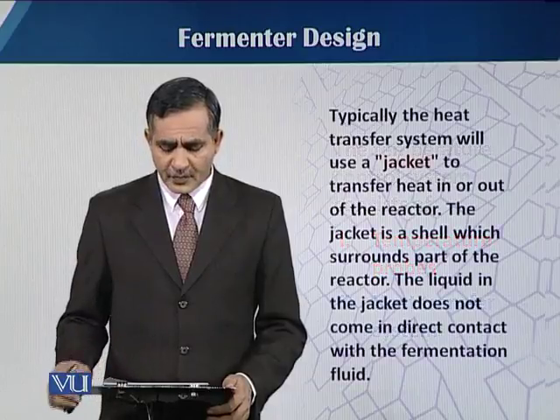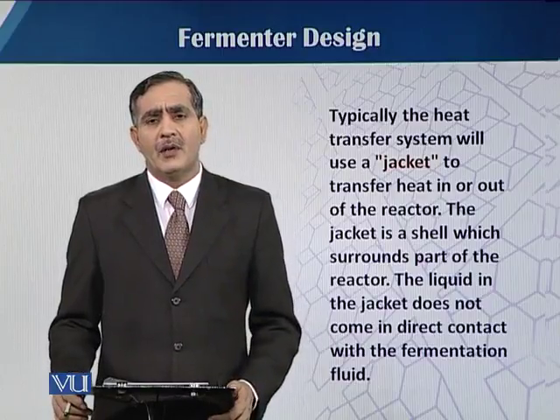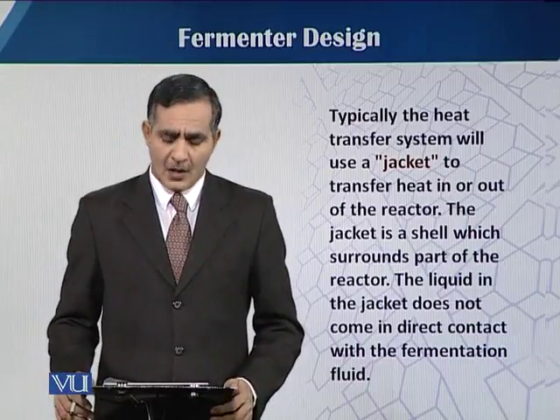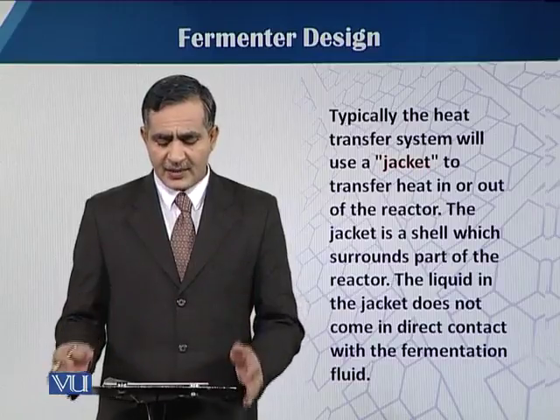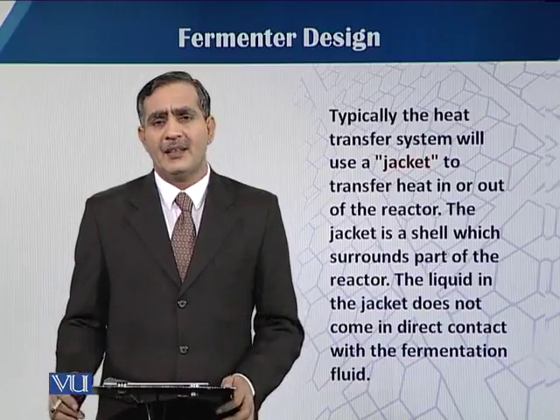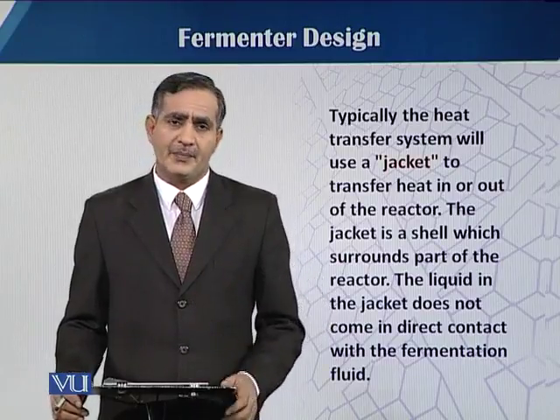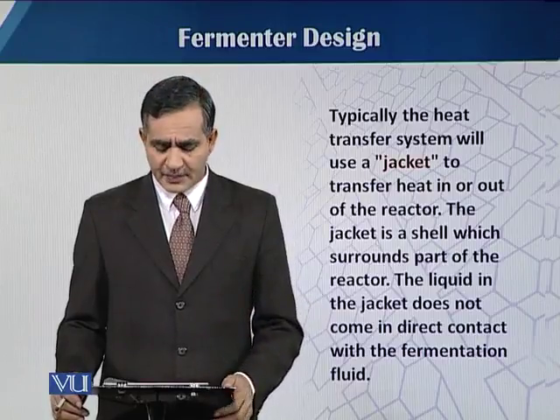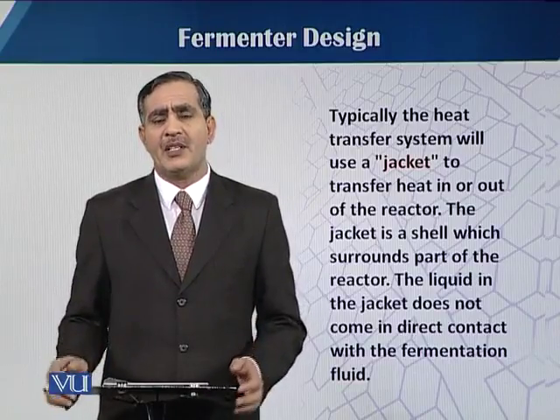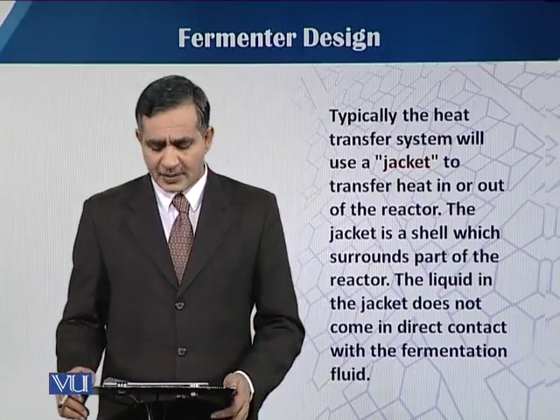In a temperature control system, mostly in fermentation, when there is a disturbance, a change in the temperature, a jacket is mostly used for controlling the temperature. That jacket is linked with hot or chilled water according to the need of the fermentation temperature. The jacket is just like a blanket or a shell around a fermentation vessel, so it is mostly used in small scale fermenters.